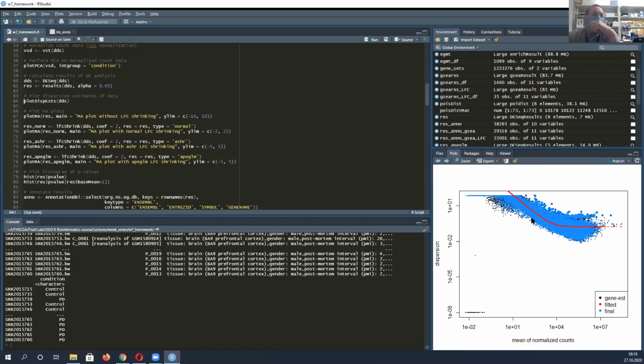So this is for each gene, what the statistical model did to it. It kind of adjusts the model for each gene based on the information from the entire data set that you give it. And I'm really not sure about how the math works there. That is way above my pay grade.